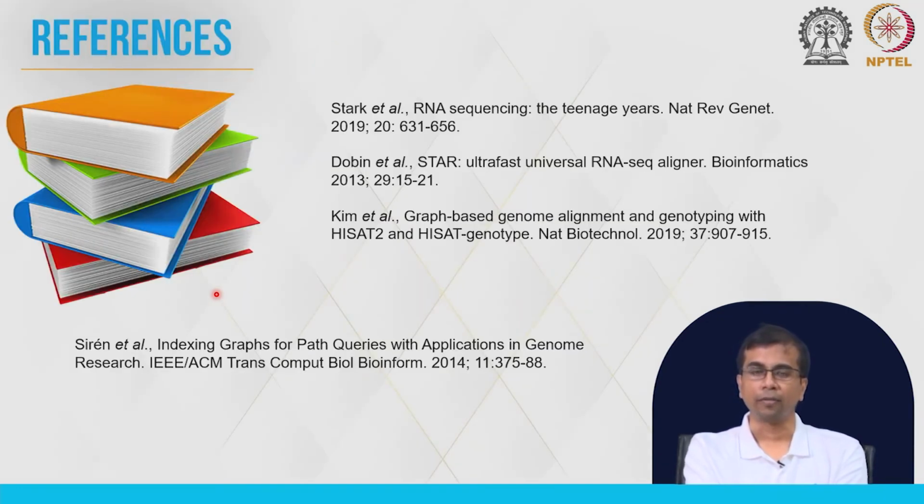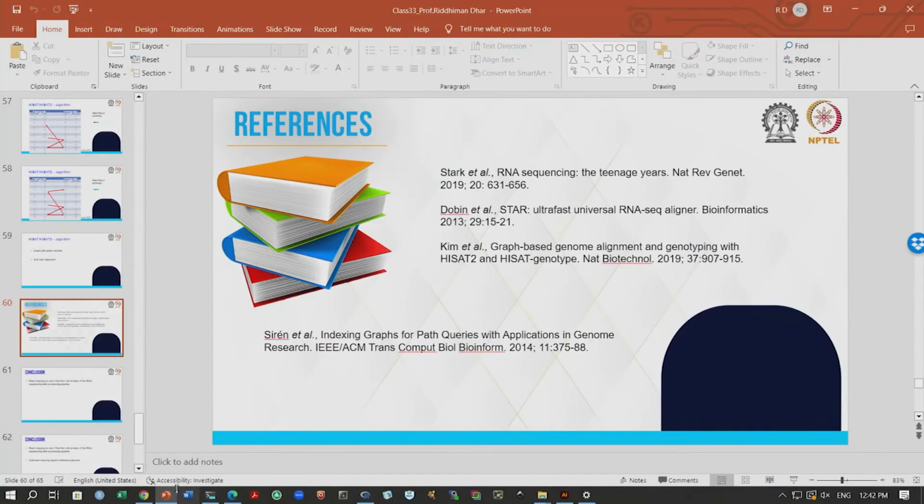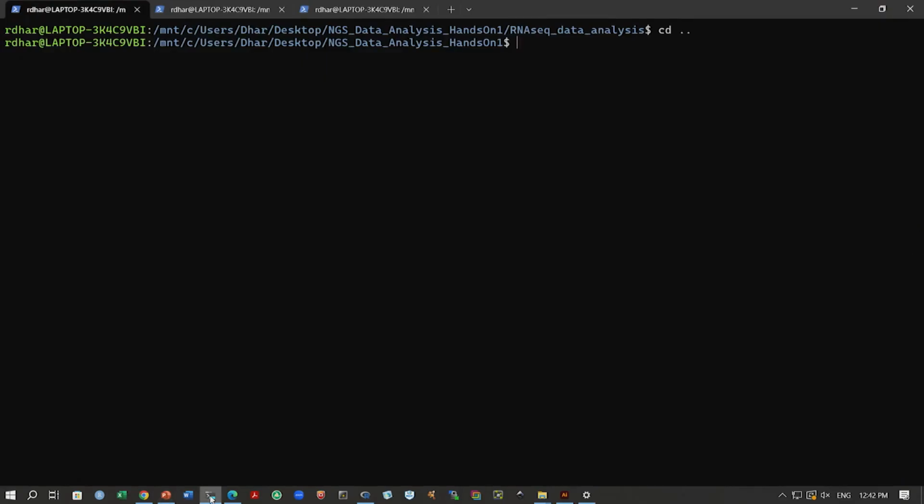Okay. So, these are the references that we have used. What I wanted to do now is just show you the HiSat2 program before we conclude this class. So, I will go to this HiSat2 program now. Okay. So, let us see.